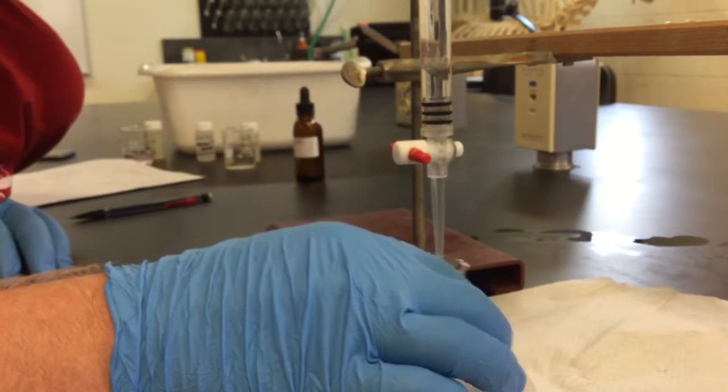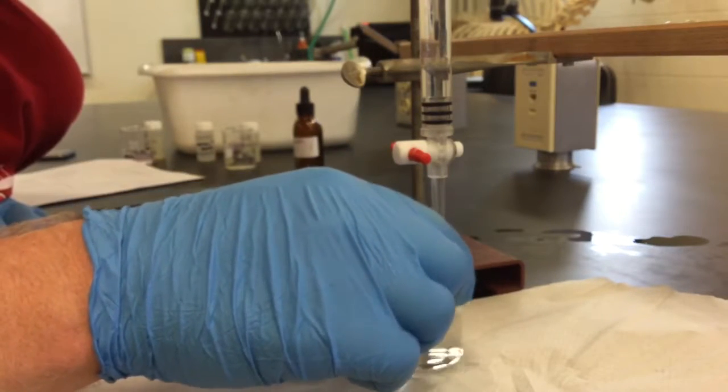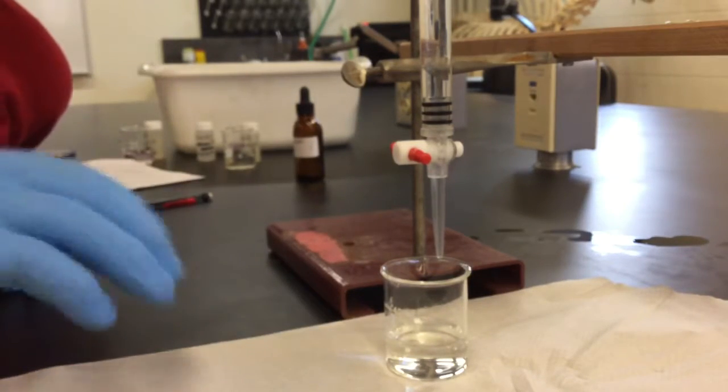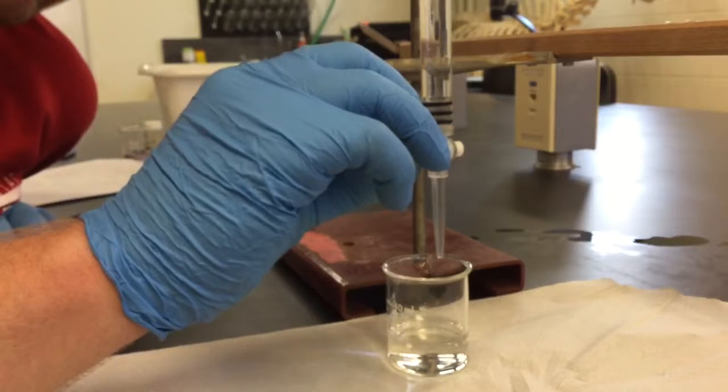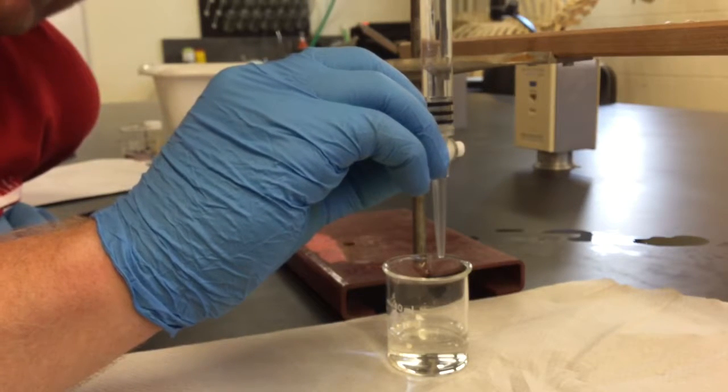You can see I swirled it and the pink color went away. That means we have not yet neutralized all of the acid in the beaker, so I'm going to go ahead and turn it back on.